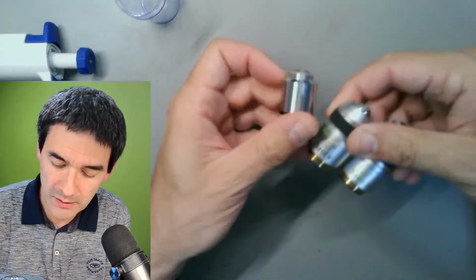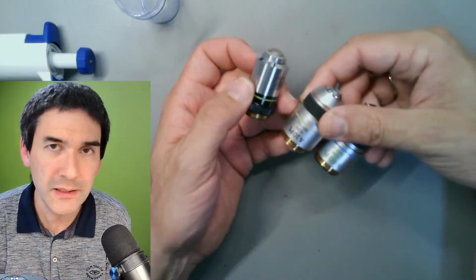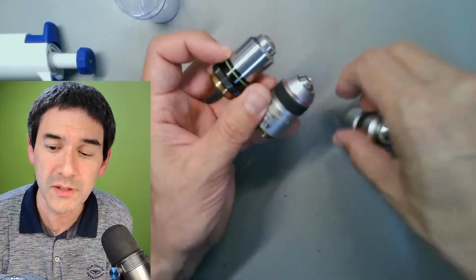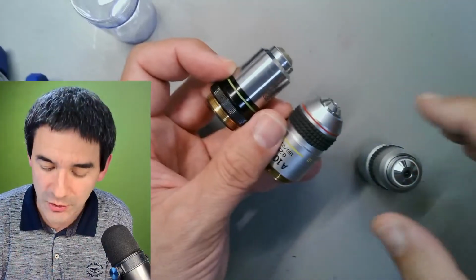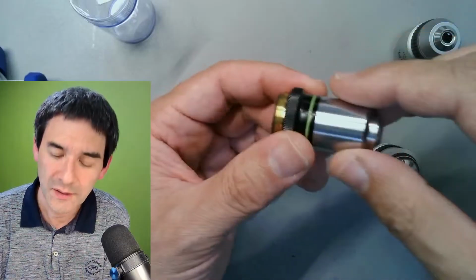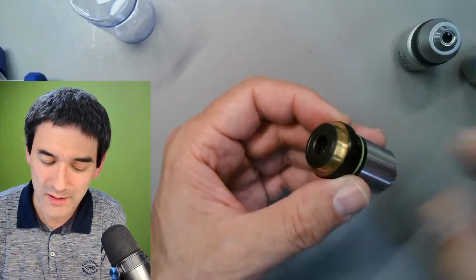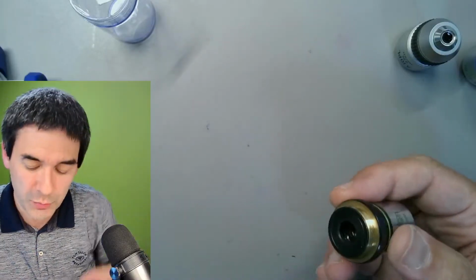Simply so that you're a little bit aware of the different types. Maybe in one of the upcoming streams or so, I might be talking about some infinity optics, which is again a completely different category. But in any case, I just wanted to show you that those old Olympus objectives basically have the same standard as some of the modern low-cost introductory objectives that you find.